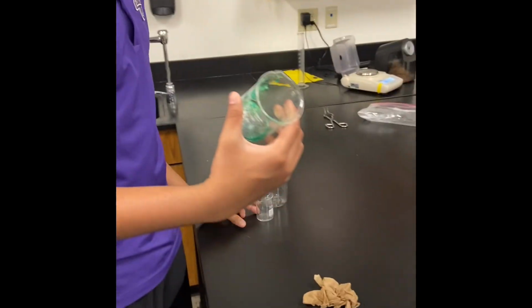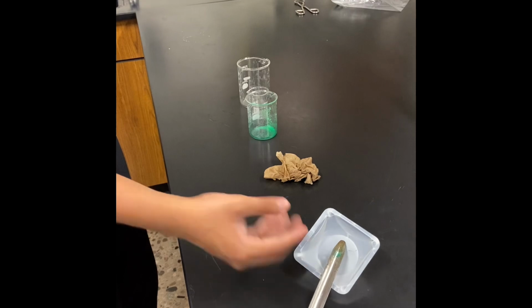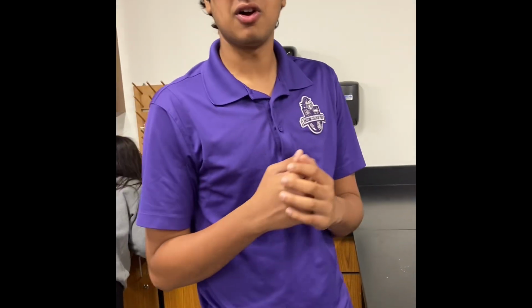As we're done with this lab, make sure you clean up all your beakers and all the stuff that you used here. We used a total of 3 beakers, something to stir and everything, so make sure your lab space is nice and clean. We'll come back for the results tomorrow, and thank you for listening.